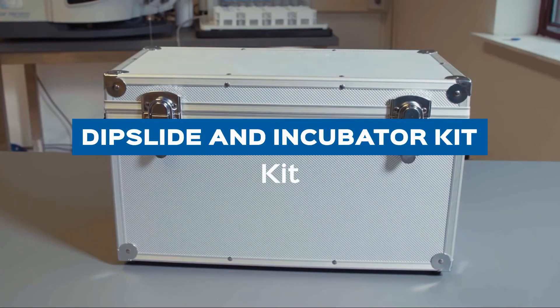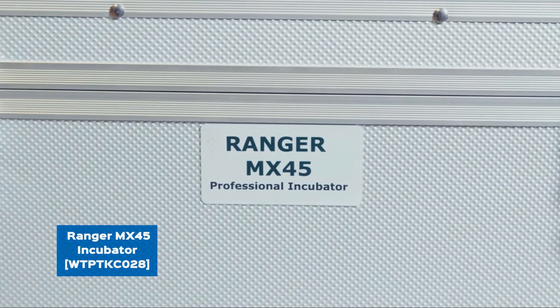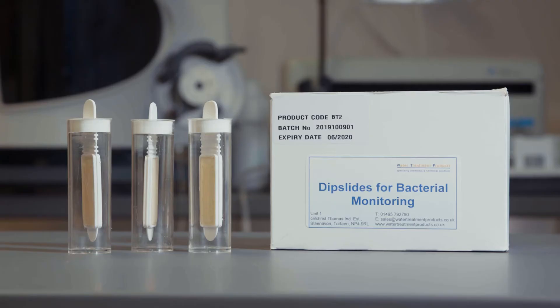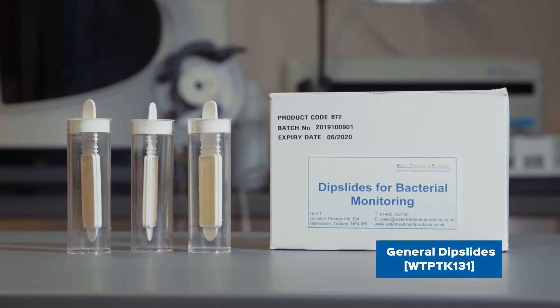This is an instructional video on how to take a dip slide of a water sample and incubate correctly. In this video we use a Ranger MX45 incubator. We also use WTP general dip slides for bacterial monitoring.